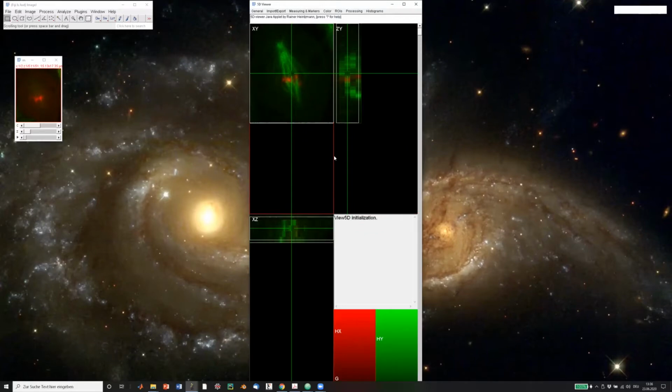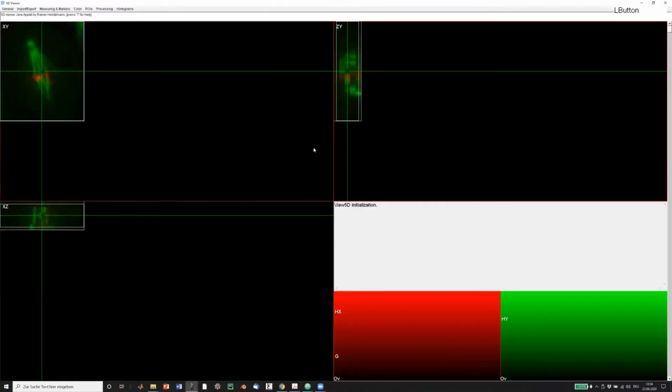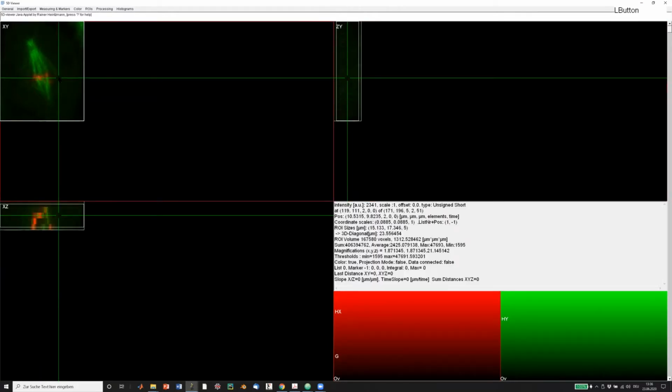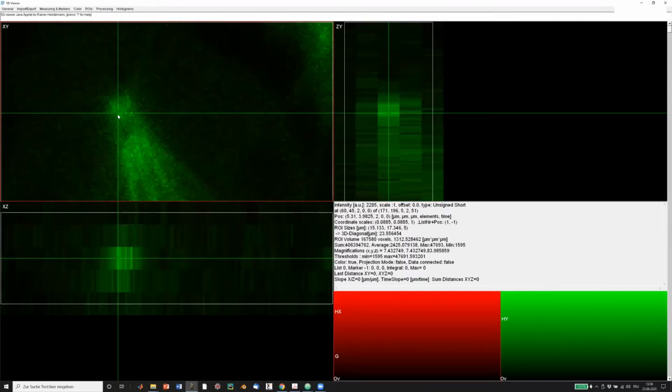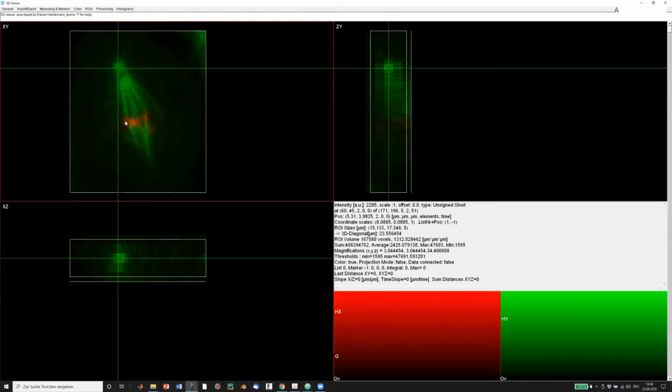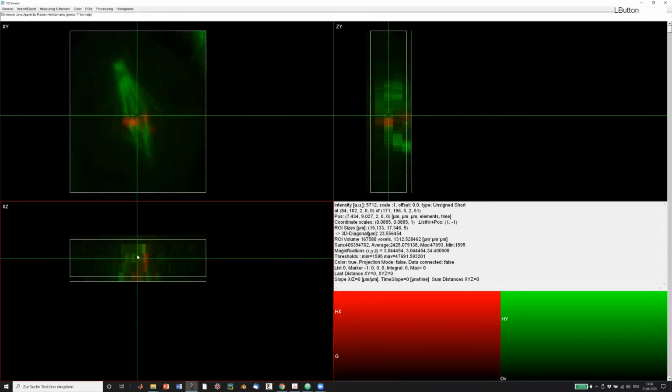Typically, this window is not necessarily the size that you want it to be. So if you click big screen, we're going to see the whole View5d filling the full screen here. Now, it is useful to go somewhere with your mouse into one of these panels and press I for initialize. If you press initialize, it should initialize the view so that this is filling out the display.